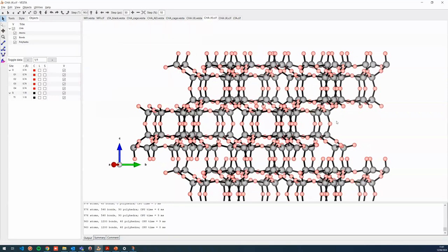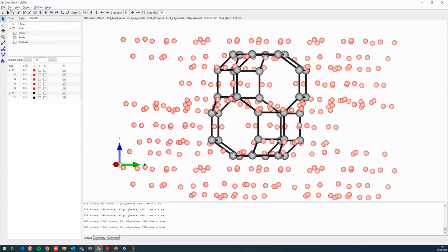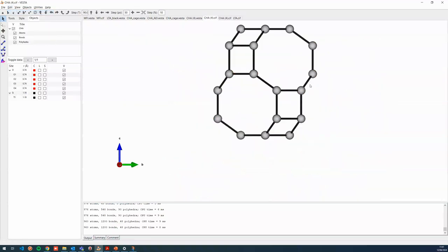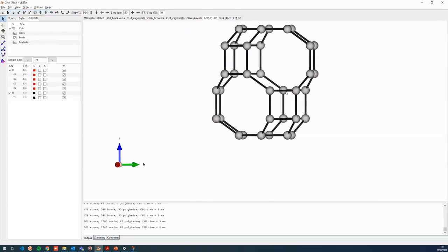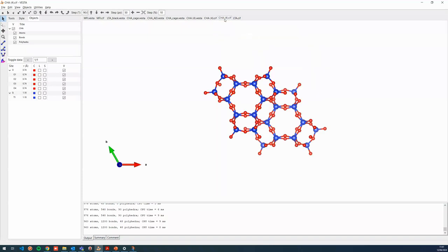But you see, if you do this, everything in the boundary gets reset. So all our work is gone. You can luckily undo this all by doing undo or Control Z, and we go back to this. But you can't really make the change without going through the work again of deleting everything. So this can be quite cumbersome. And there's a better way to do this, but it's obviously more time consuming because it's not a quick and dirty way.